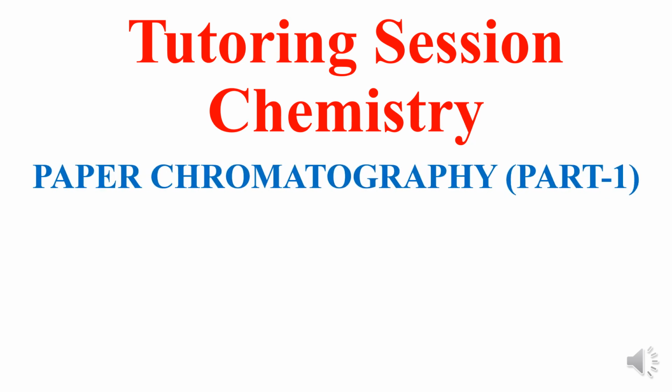In this video, I'll explain the principles involved in paper chromatographic separation method. The current video is part 1 of the two-part series in paper chromatography.